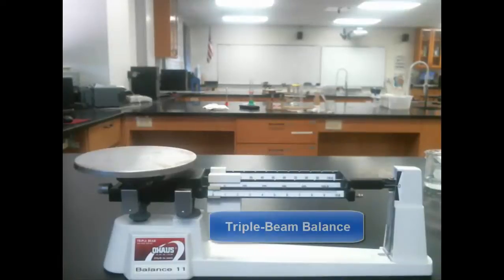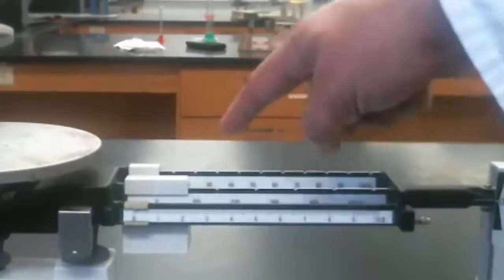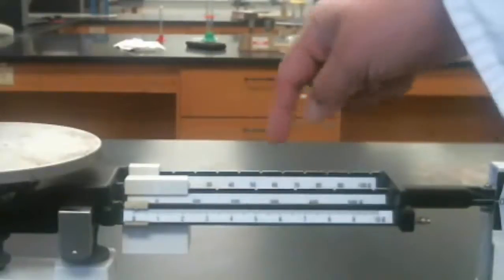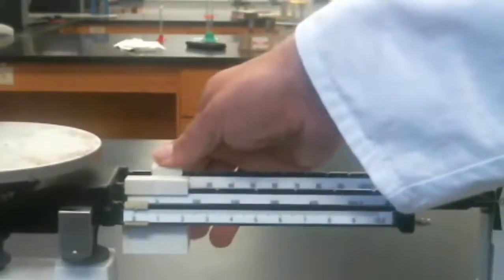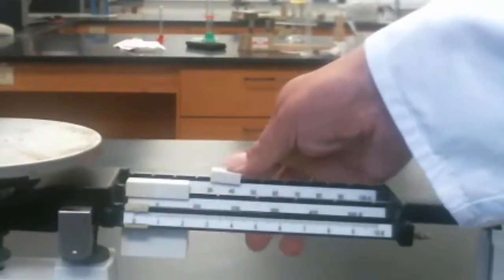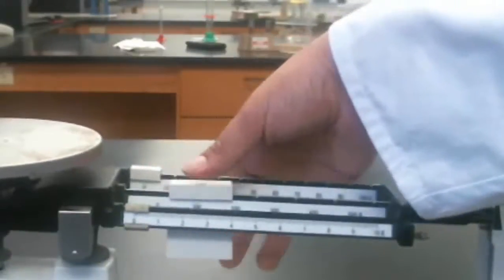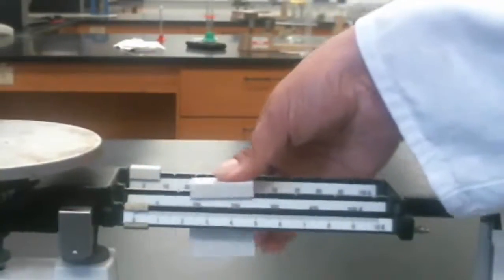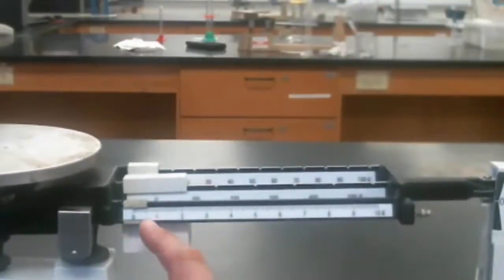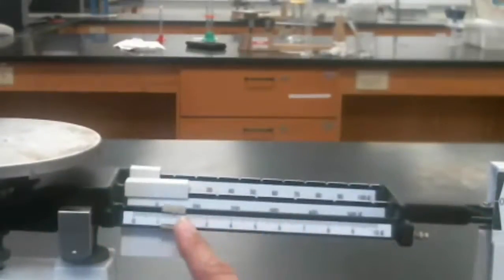This is the triple beam balance. It's called a triple beam balance because it has three beams, and on these beams are some sliding weights. The beam in the back measures 10 gram increments. As I slide this weight down, you'll hear it lock into place every 10 grams. The one in the middle is every 100 grams, a much larger slider. And the one down here is a single gram slider, also divided up into tenths. This one just slides freely up and down the beam.